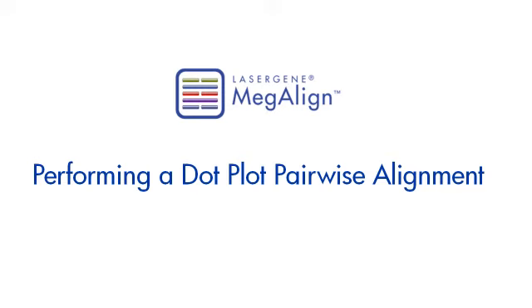MegAlign's dot plot view allows you to perform and visualize pairwise sequence alignments. In this video, I'm going to show you how to create, customize, and interpret the dot plot.